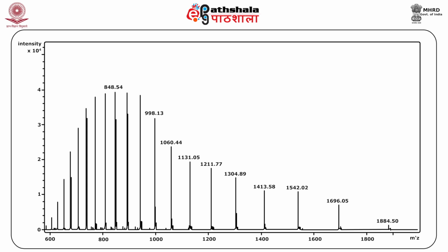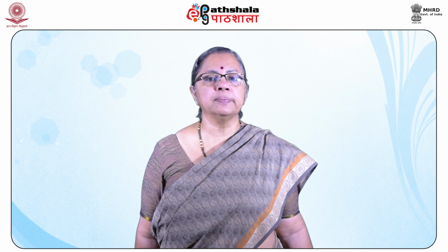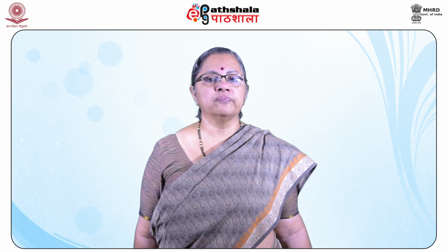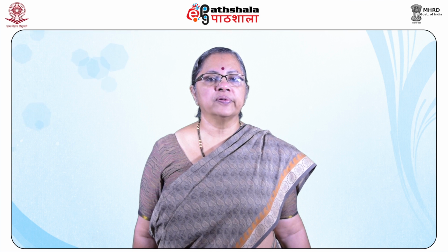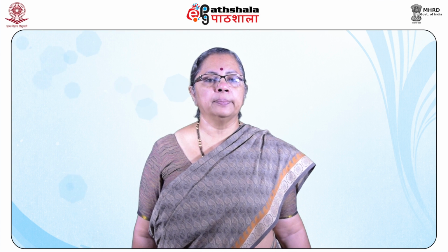If the charge or Z value of the ion is known, its mass can be more accurately determined. Alternatively, if the m/z values of two adjacent peaks of a peptide of mass M are alpha 1 and alpha 2, arising from ions of Z1 and Z1 minus 1, then two linear equations can be derived from which the value of M and Z1 can be derived.